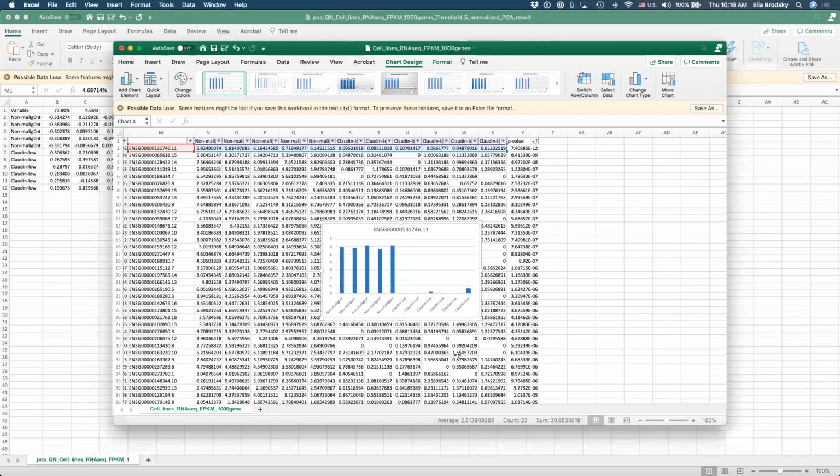Okay, how do we actually do this kind of an analysis in a proper way? What do I mean by a proper way? Well, there are two major issues that we did not address here in this simple Excel analysis. The first one is we used just normalization using logarithmic values, and that doesn't mean that we accounted for some artificial variation that is only preserved in the raw data. So we need some more advanced normalization before we run this kind of an analysis.